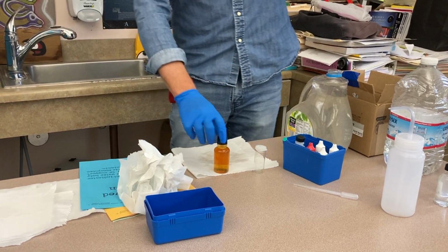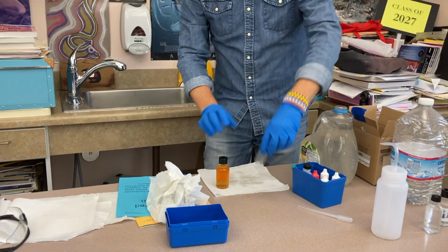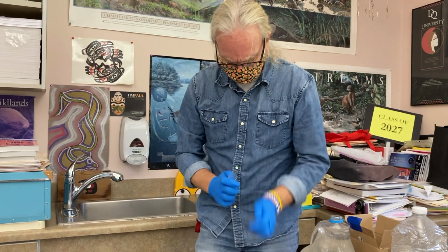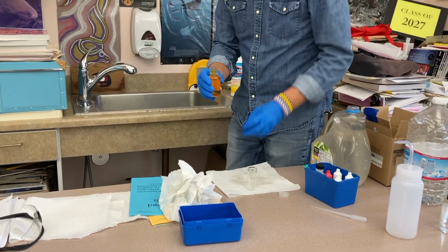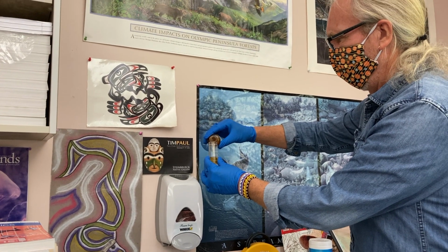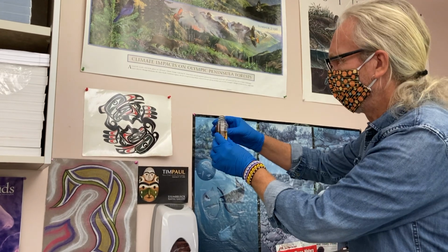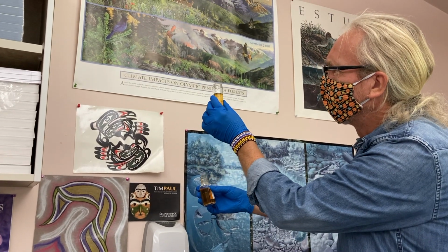All right, looks good. Now we need to transfer 20 milliliters of this into this little jar here. I'm going to do that over the sink. That's pretty good.